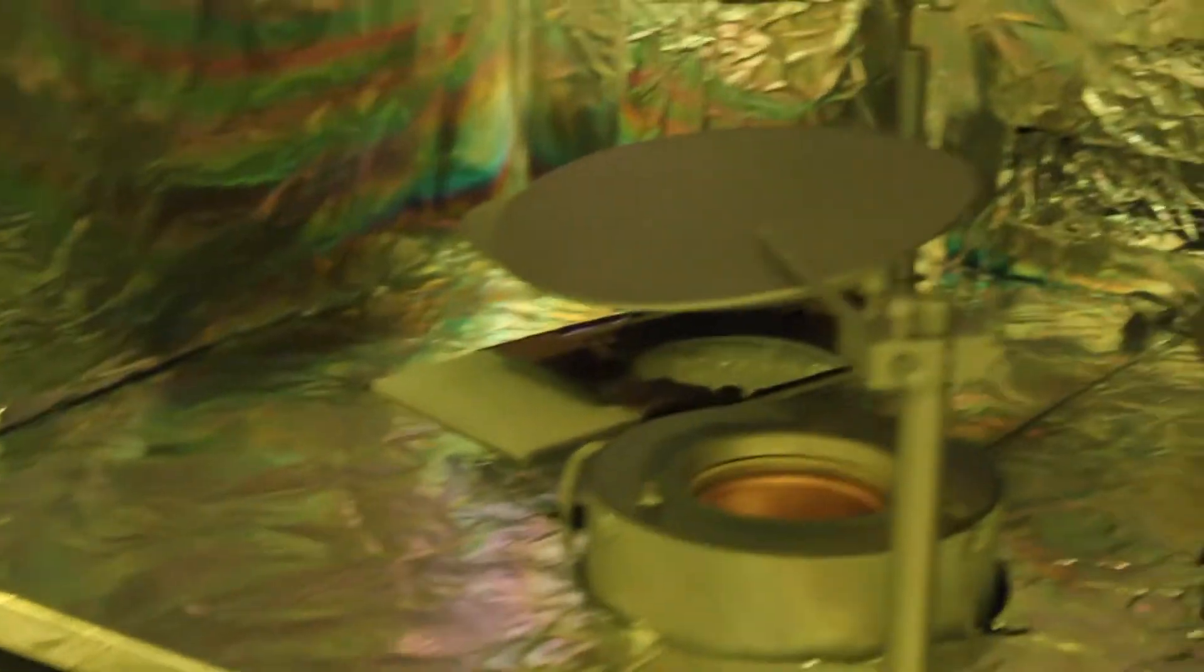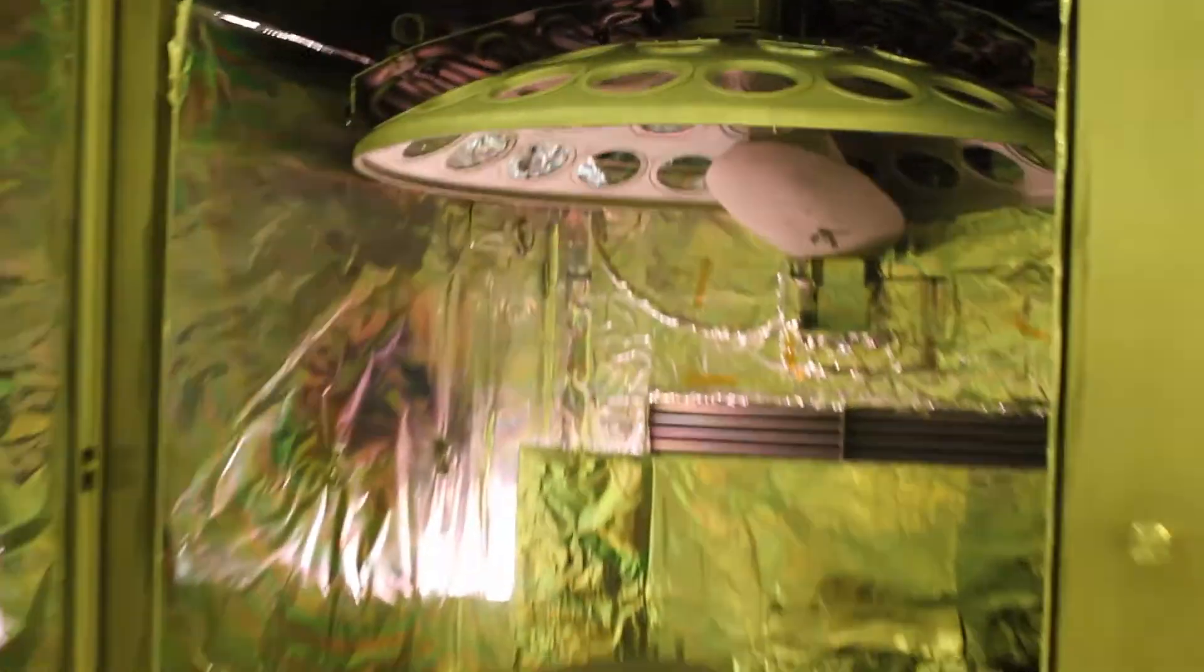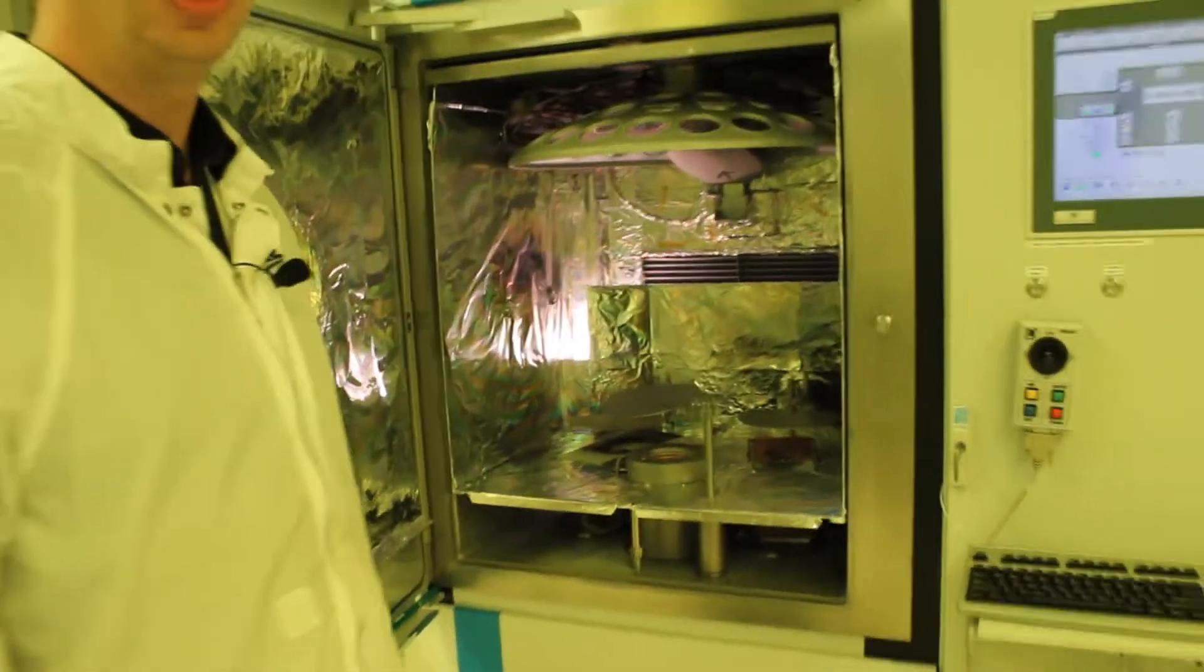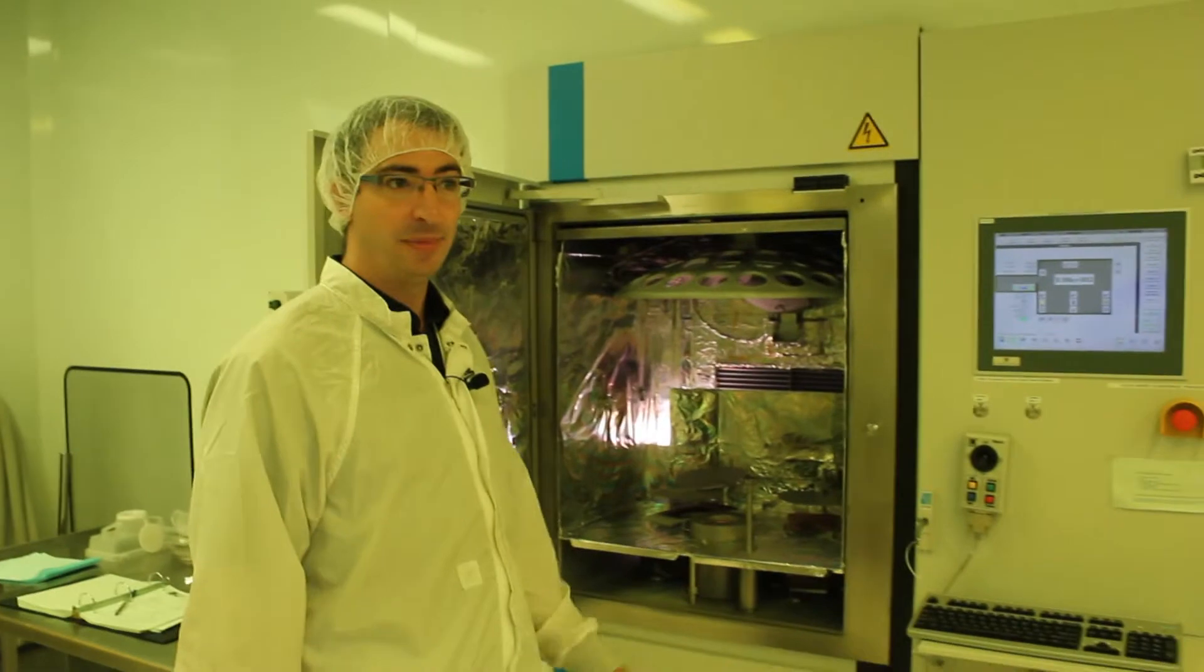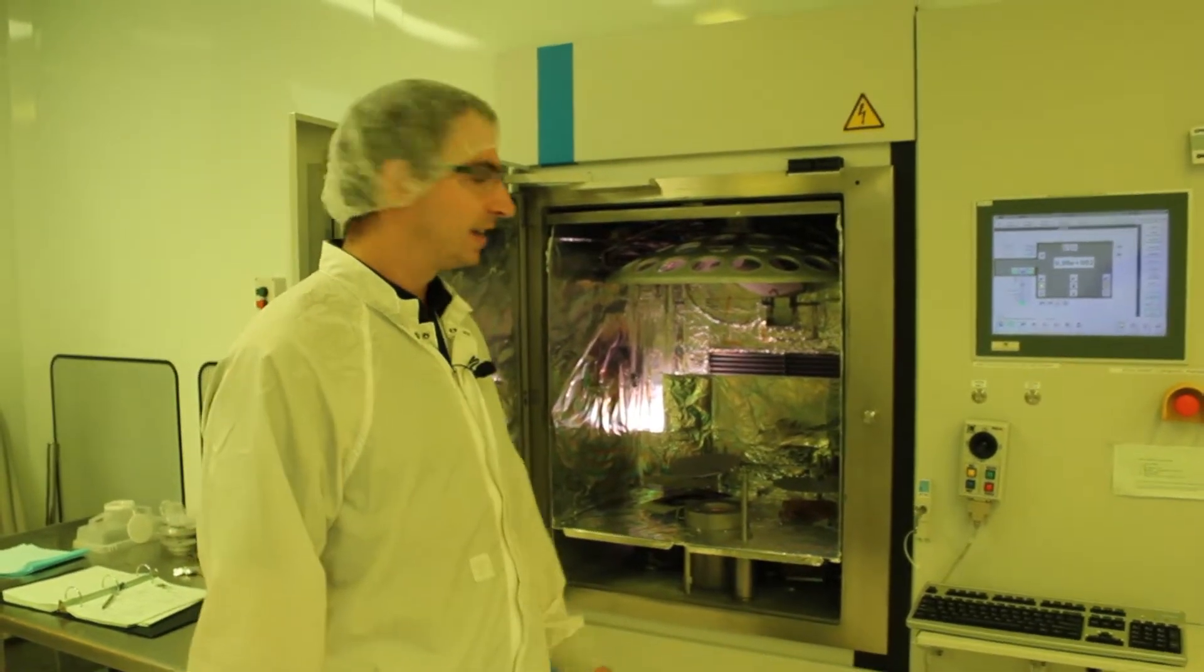If you want to get a closer look at the bottom, these are the targets. What we use in terms of materials for the targets are principally oxides of semiconductors and of metals. A popular configuration we use is tantalum oxide and silicon dioxide.